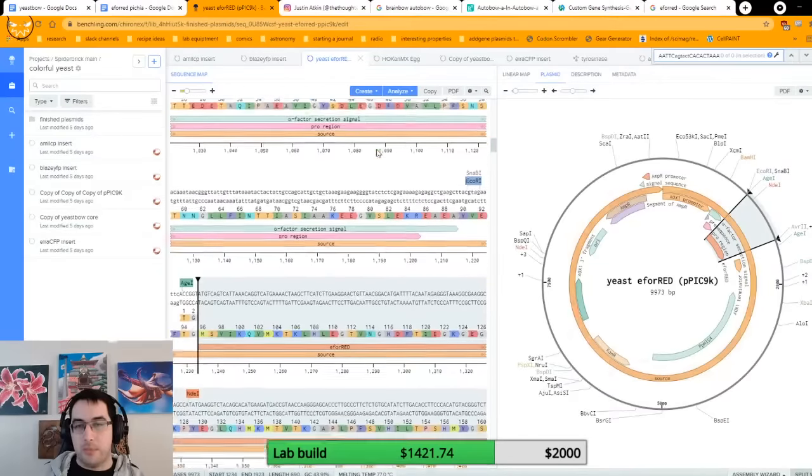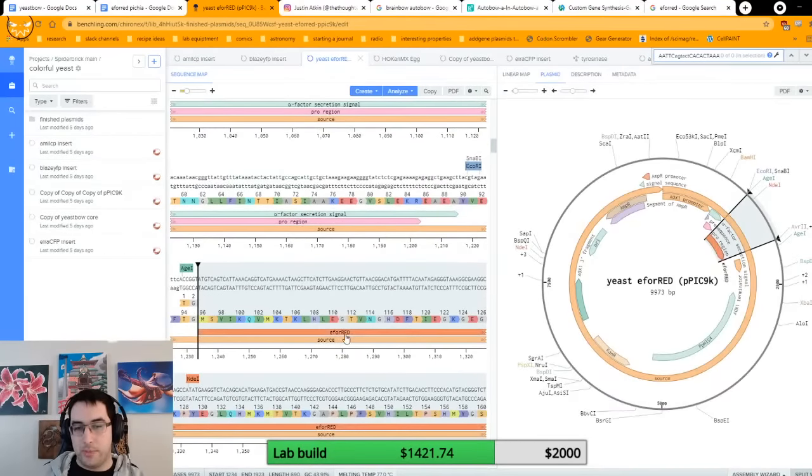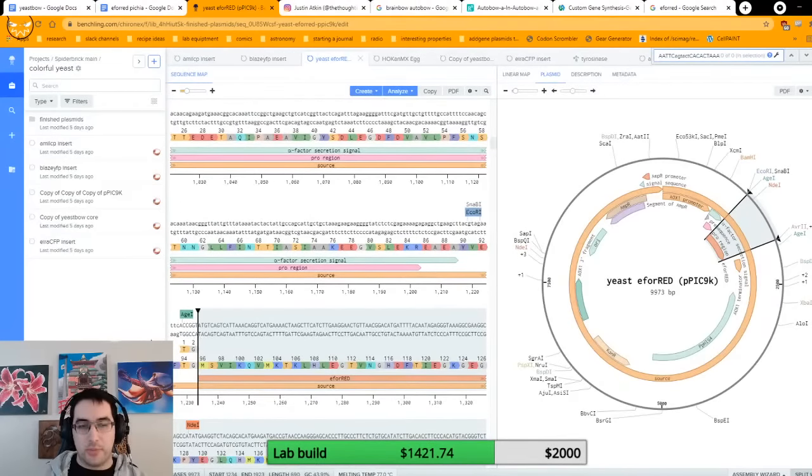So in order to make my protein, the pink one, fit and function with the backbone, I essentially need to make sure that it's what's called in frame, and there are no stop codons between the bit that I'm pasting in and the bit that I wanted to actually make. So I must have changed this both to add a restriction site here, presumably to make it easier to cut it out, but also perhaps to make sure that this is in frame.